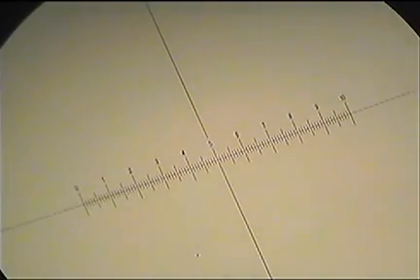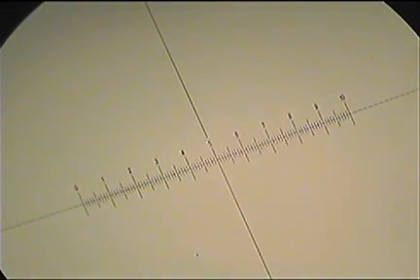Okay, so I'm just going to walk you through how to take measurements of cells or other microscopic structures using an eyepiece graticule and a stage micrometer. So under the microscope, whenever you're looking at things, you'll notice you've got the scale. This is actually something that's in the eyepiece. It's called the eyepiece graticule.